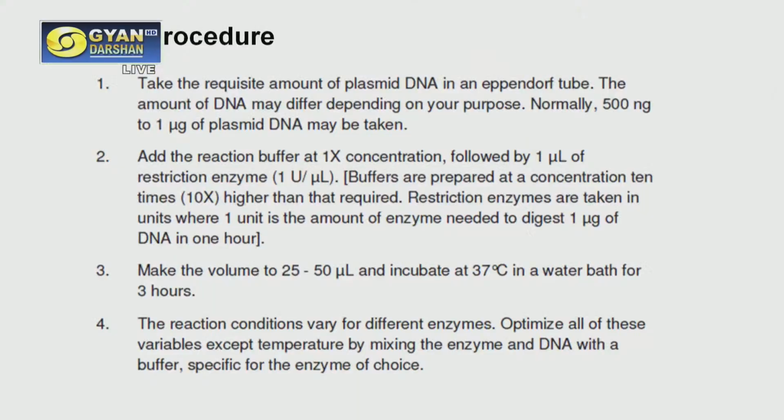Now we come to the experimental part, that is, how will you actually set up the reaction in a laboratory? If you undertake this experiment, how will you set up the reaction? Now, procedure. You have to take an Eppendorf tube and you have to take all the components. What are the components that are necessary for setting up a reaction mixture?